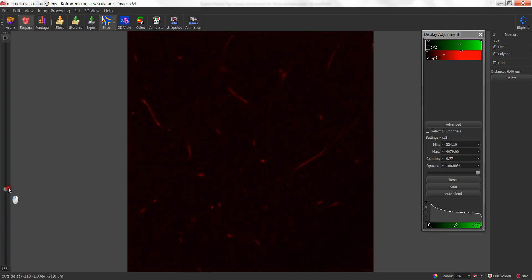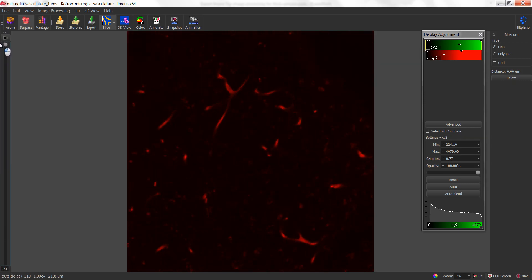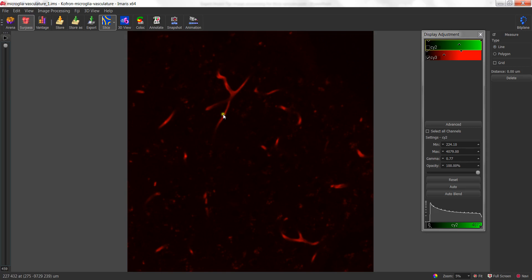I'm now going to do the top of the stack, where the signal is brighter, and I'm also going to look for a blood vessel to get an idea of intensity. When I do this, you'll notice the intensity is significantly higher than it was in those bottom slices of the stack. So we're now looking at possibly a ballpark of around 1,500 gray levels.